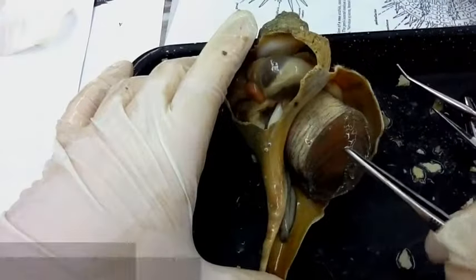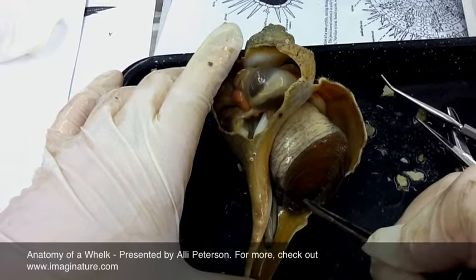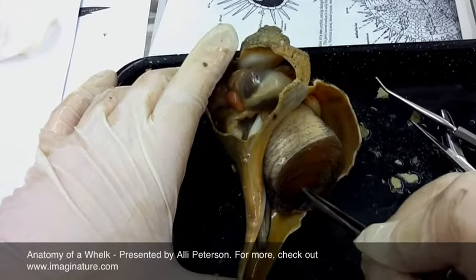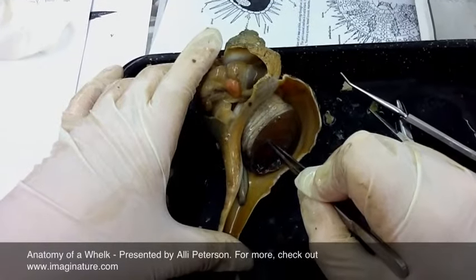We're doing the anatomy of a whelk. This structure right here is called the operculum. It will close off the body cavity of the whelk in case it's being attacked, so it will bring the body all the way back into the shell.